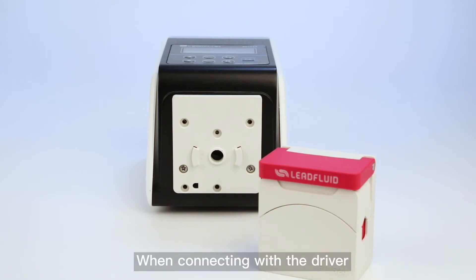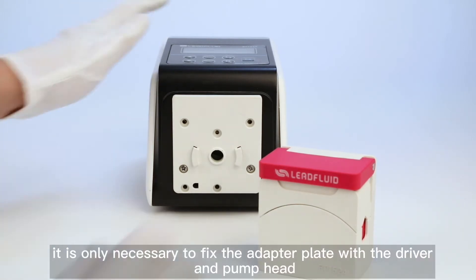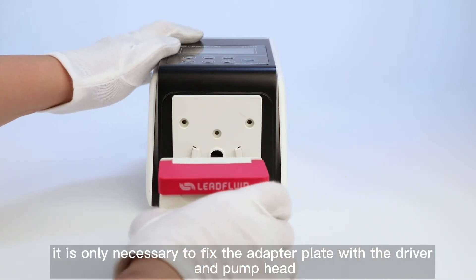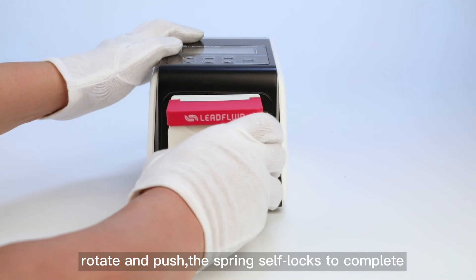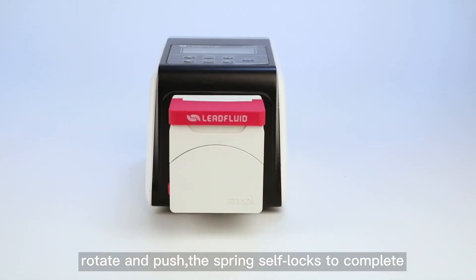When connecting with the driver, it is only necessary to fix the adapter plate. With the driver and pump head, rotate and push — the spring itself locks to complete the connection.